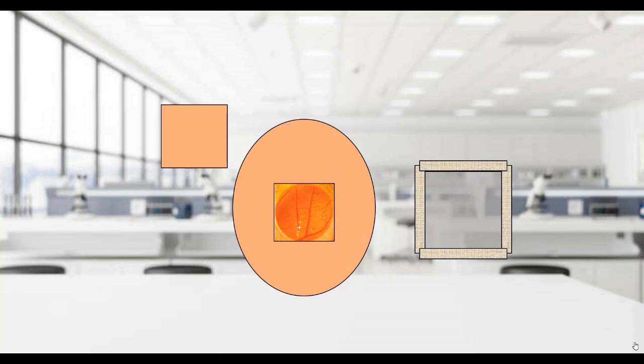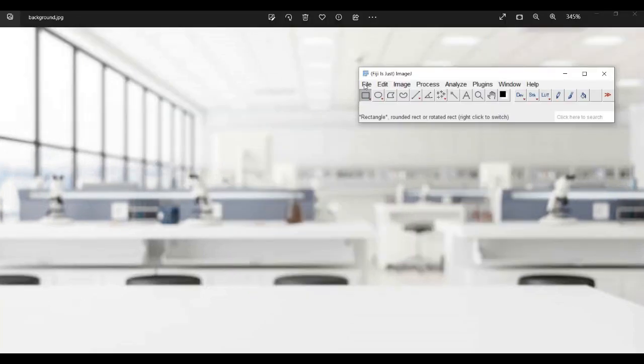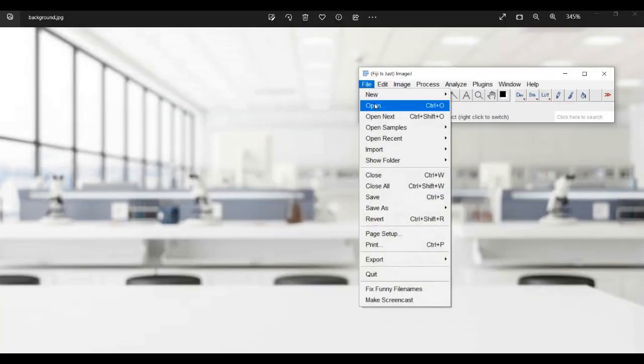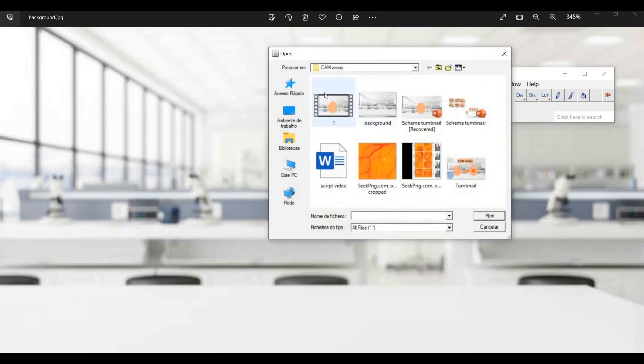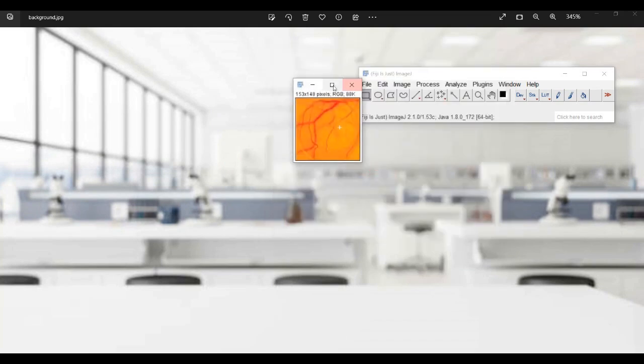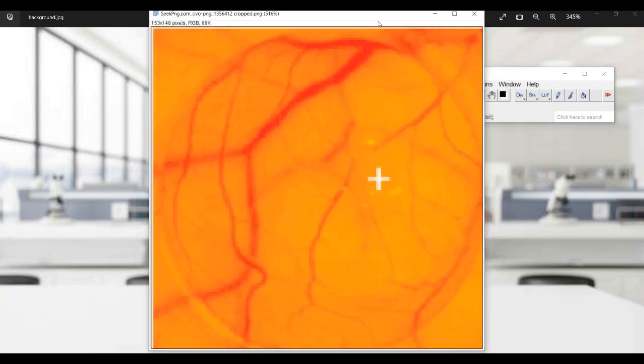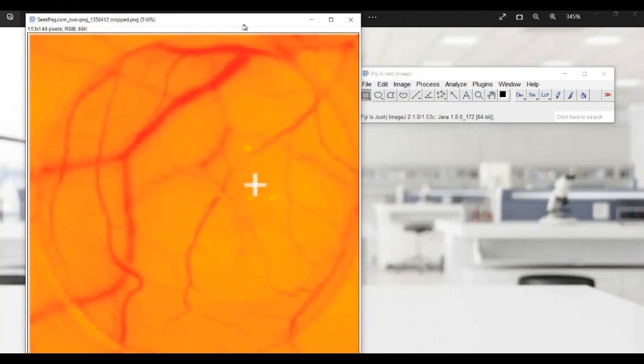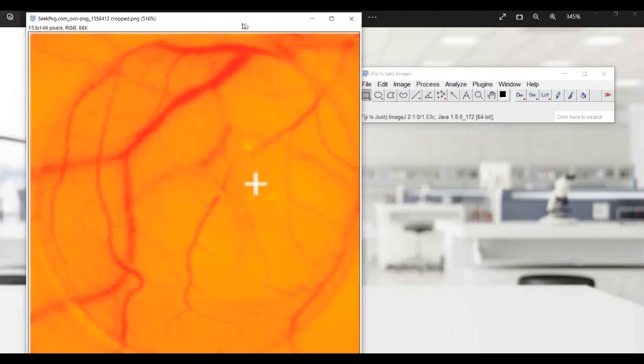during which time the substance will stimulate or inhibit blood vessel growth. The first step in analyzing a CAM assay using ImageJ is to import your images into the program. Once you have your images loaded, you'll need to prepare them for analysis.